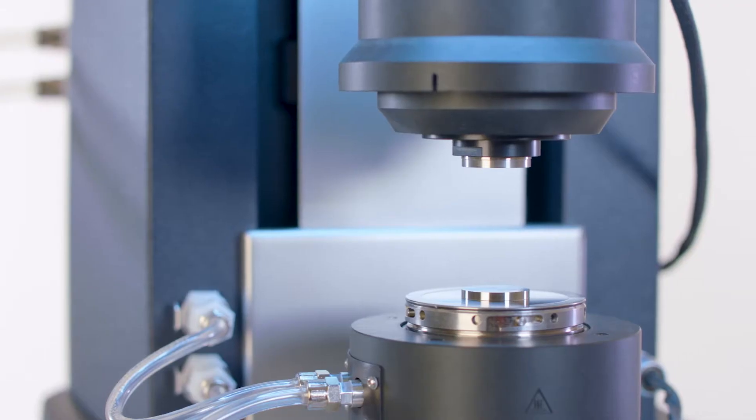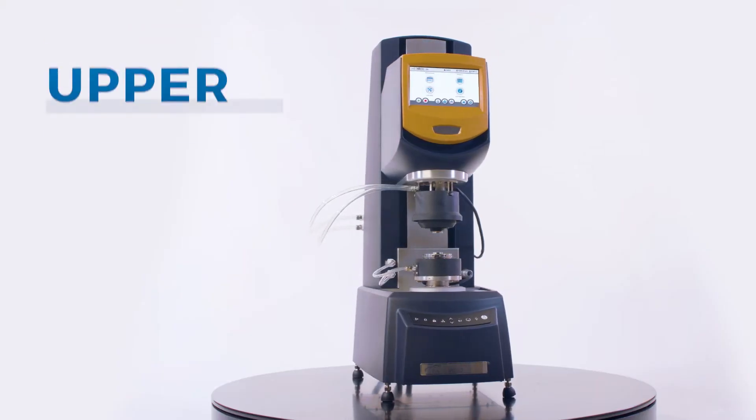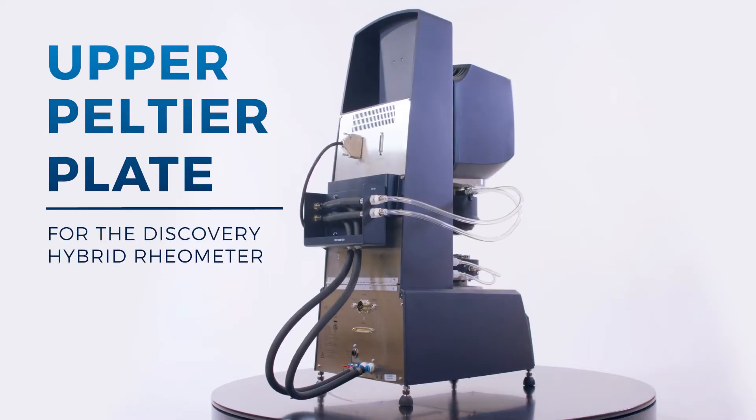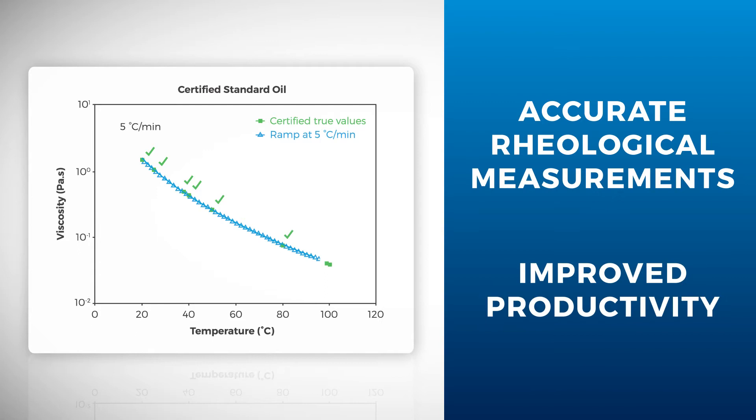TA Instruments, the world leader in rheometer technology, offers you the complete solution with the Upper Peltier Plate for the Discovery Hybrid Rheometer. The Upper Peltier Plate allows users to perform accurate rheological measurements over a wide temperature range with improved productivity.